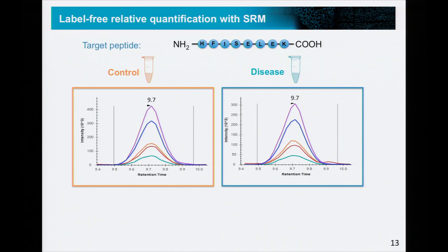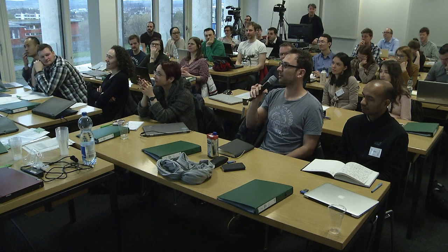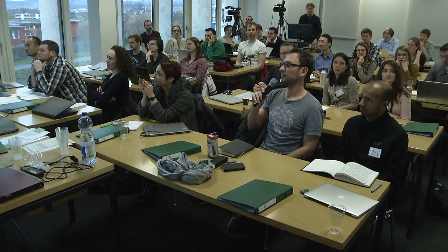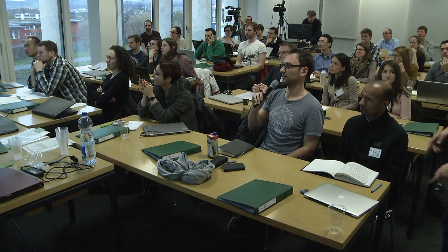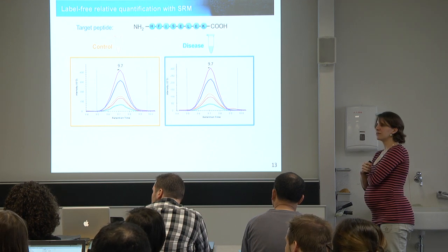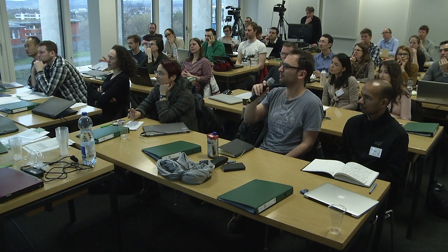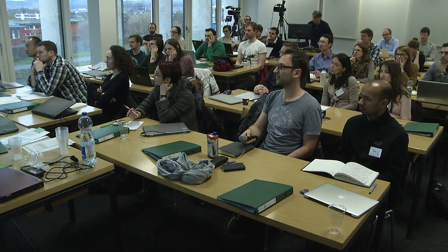First of all, you make some replicates. Oh, very good. I agree. Okay, we have replicates. What do we do now? How do we get the quantitative? You compare the total intensity of all transitions. So I have many peak areas, right? I have 5 peak areas now. What would you do with these 5 peak areas? You sum them up and you compare them, or alternatively you take the ratios of the individual ones and then you see the variation. Super. These are the 2 main ways people do it.